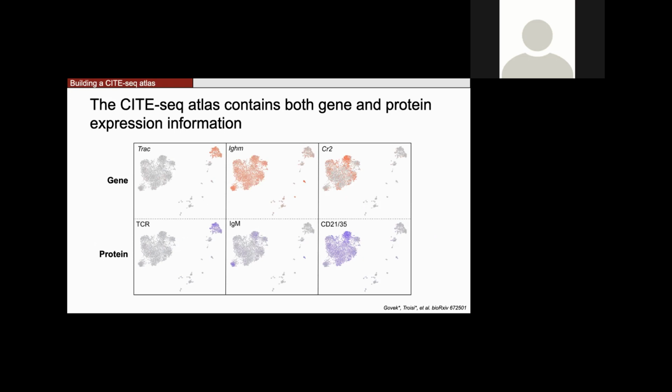Which is pretty standard for CiteSeq data. A lot of that is dealing with the sparsity of the data, so it's not quite easy to interpret. So we know that our CiteSeq data is up to par with what CiteSeq data is normally.